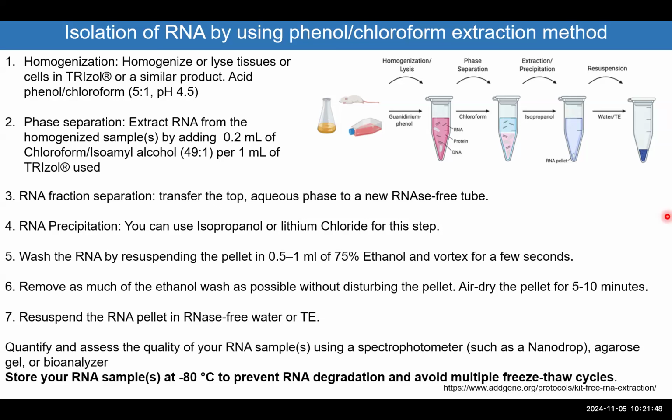This takes around 30 minutes, if you are doing it. In 30 minutes, you can do that in the lab. Your homogenization is like 1 or 2 minutes.